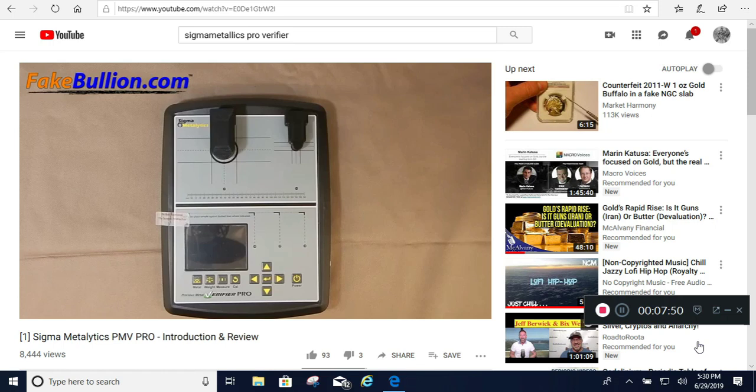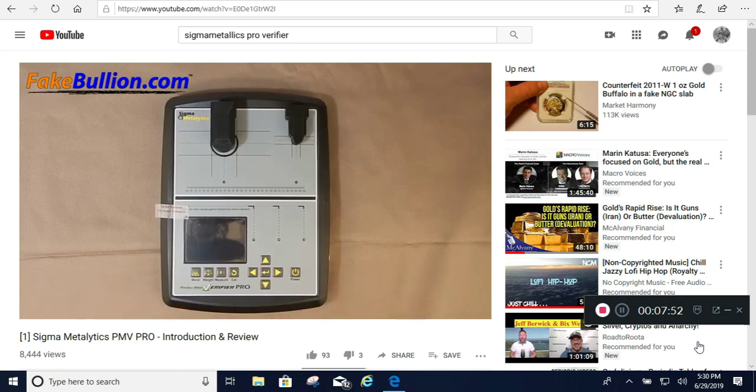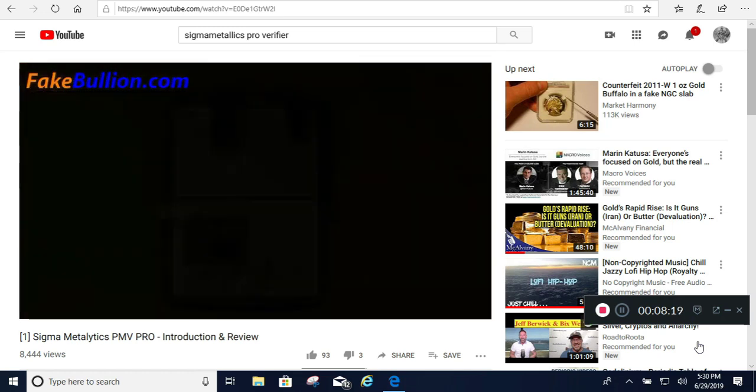There are also a few typos in the menus and an issue with calibrating the wands, and they've dialed in some of the ranges since I received this unit. All of that has been fixed in the next version of the database which will be on the production units. Shipping one of these back and forth across the country revealed an internal component that had a tendency to shake loose, and Sigma addressed that by adding internal bracing. It's been nice working with the guys at Sigma — they've been very open to feedback and have really addressed all of my concerns in the finished product.